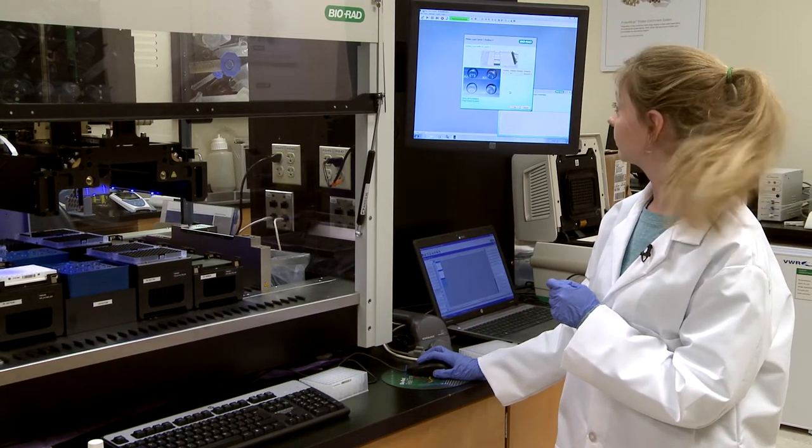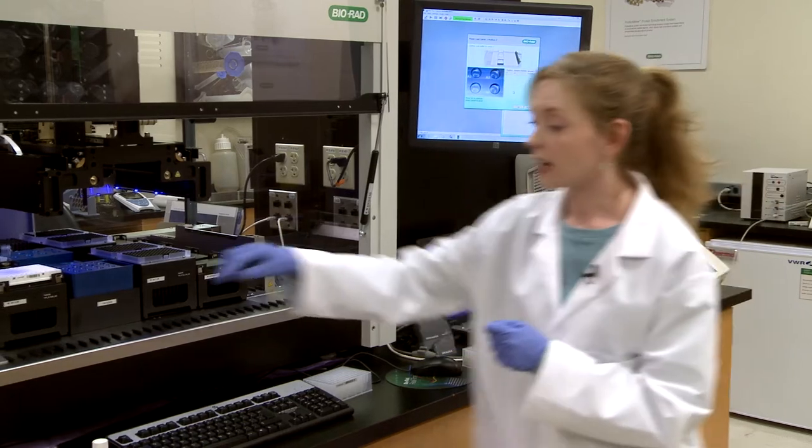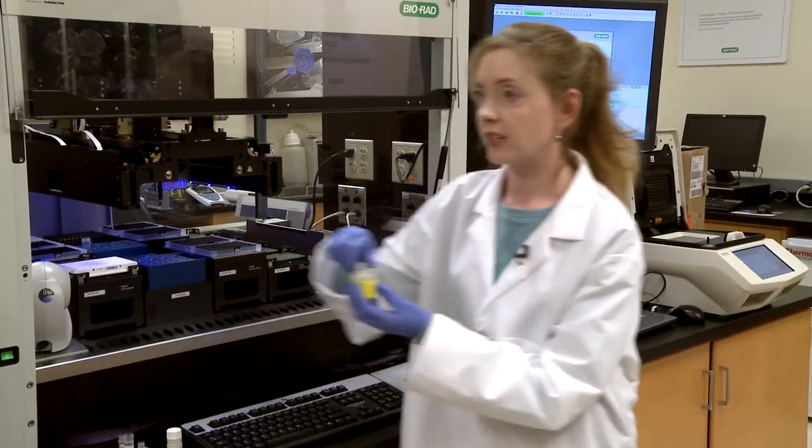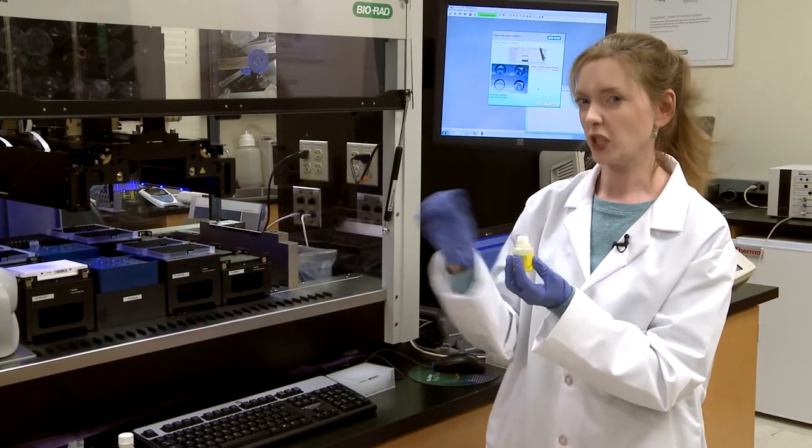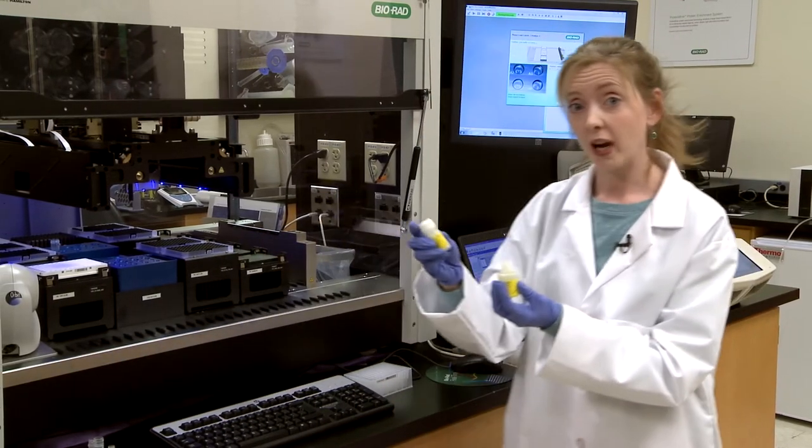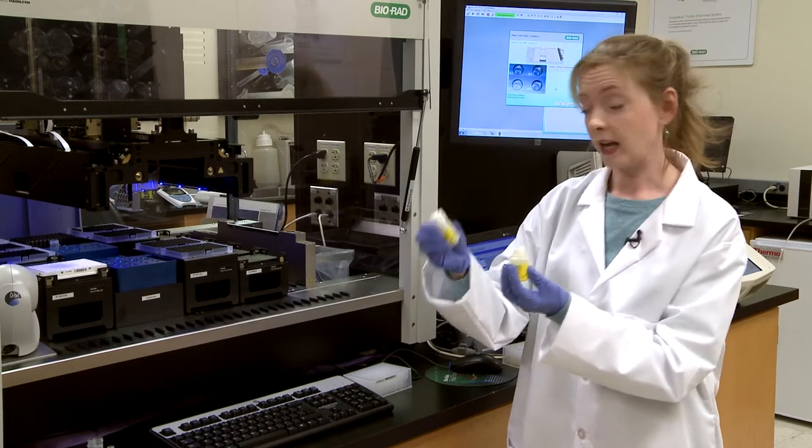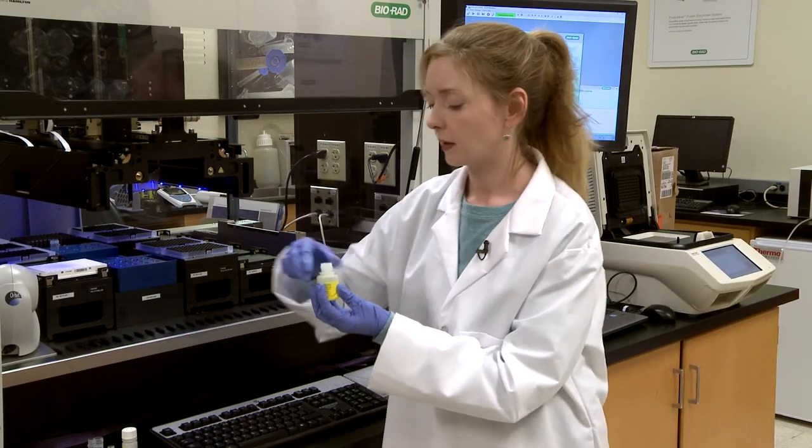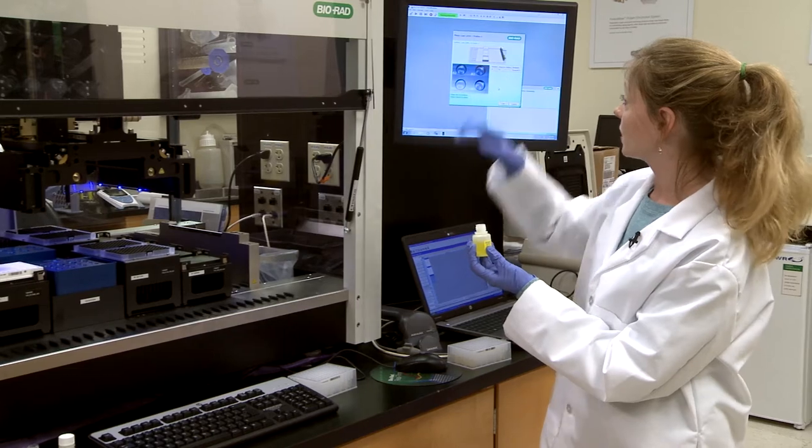Let's find out what's next. Next is the lysis reagent. You'll notice I've taken off all of the caps. You want to take those off before you put it in the instrument. That will be an expensive error, and also at this point if you have grinding beads you would add them right now but we're not using them for this. So that goes into position A1.